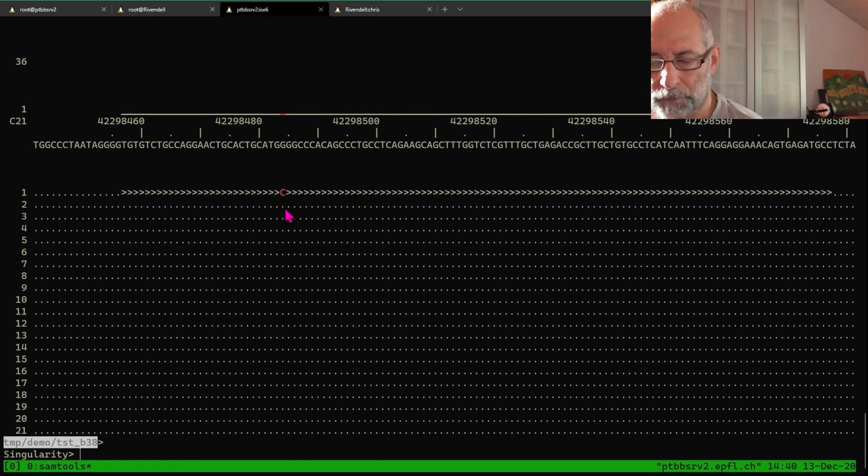Okay, so we have MiCMap going on this new workstation. I hope this video is useful. Feel free to get in touch in the comments or on the GitHub page if you have problems or questions.